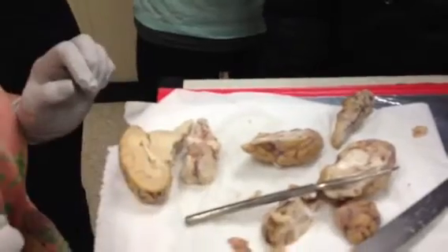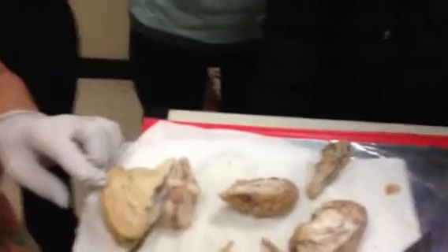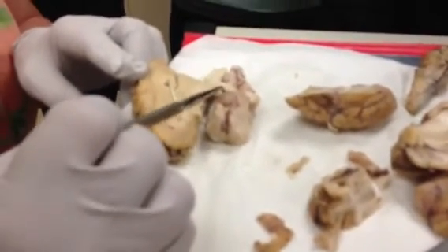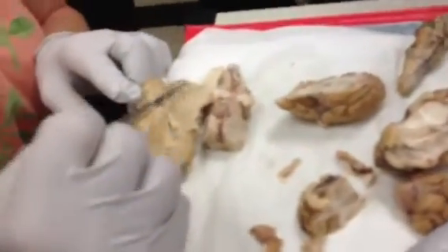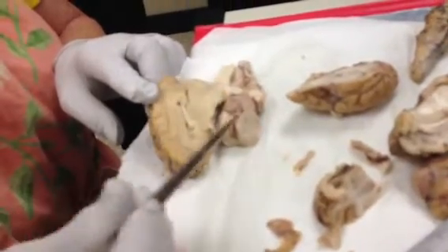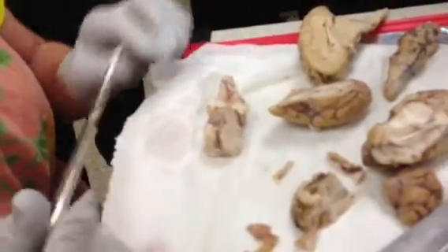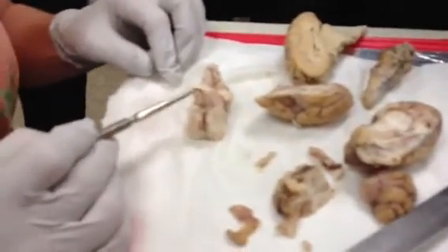Okay, does it make sense now? This is this. Okay. This is this. This is this. This is sitting on that. Okay? So to give you some perspective, this is the cut surface of the thalamus. I didn't have a pineal body. There's your pineal gland.